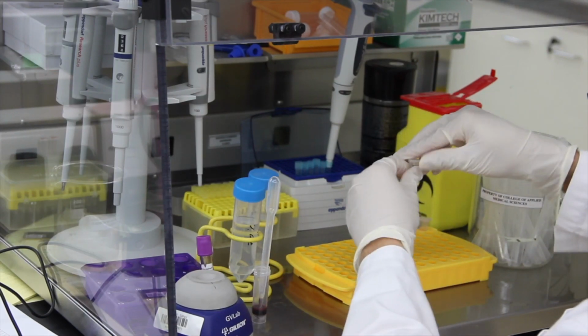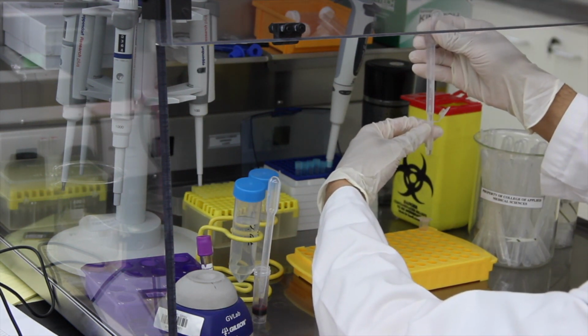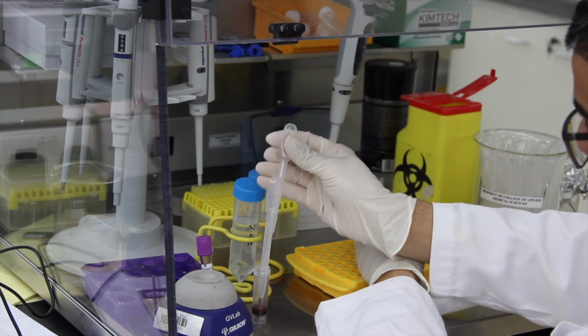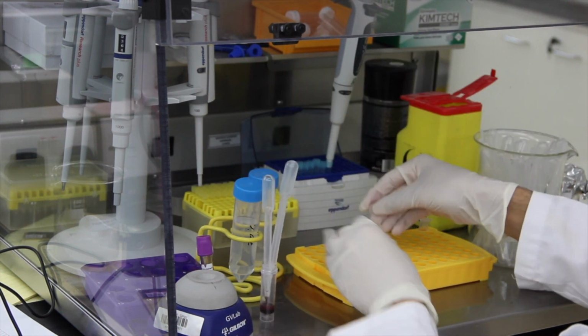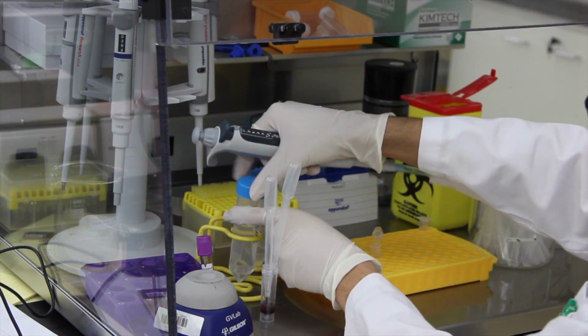Notice the white pellet. If it is there, discard the supernatant. Then add 300 microliter of 70% ethanol.